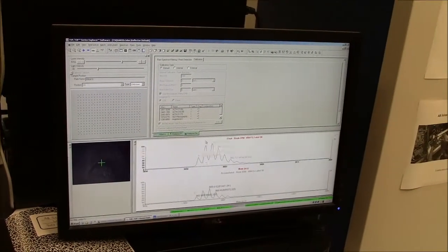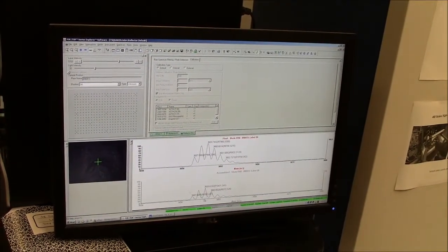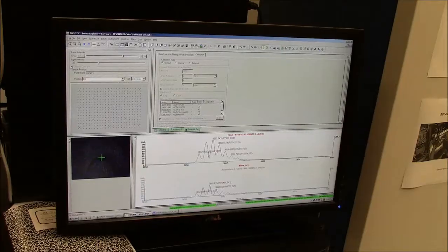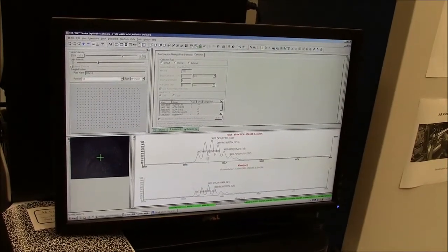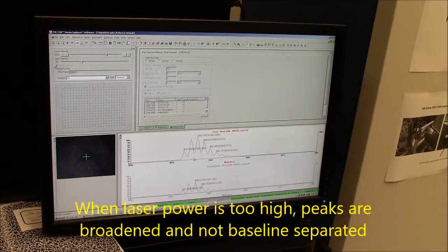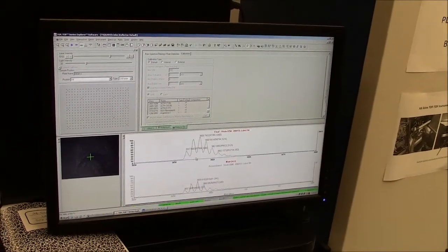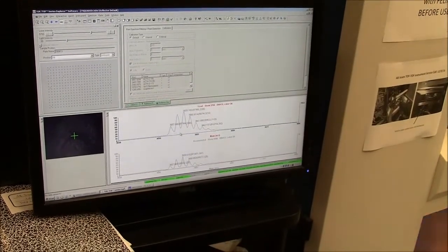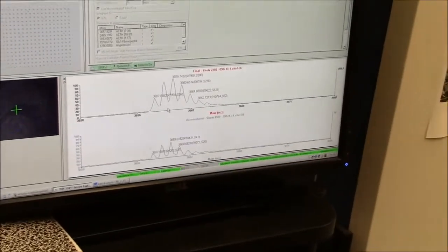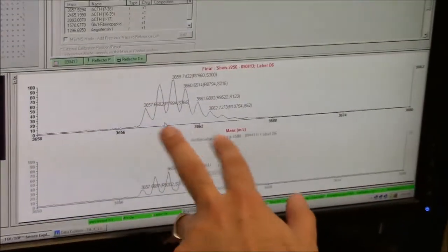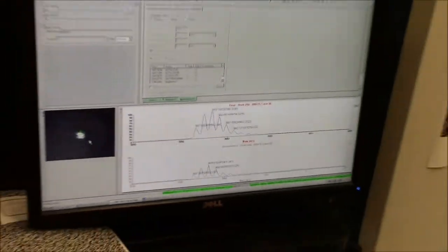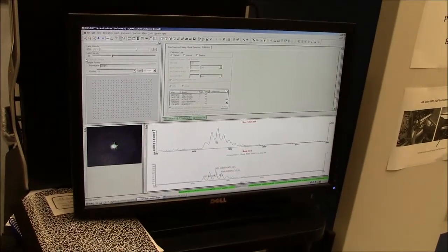Now you can see this a lot better, right? But you can notice that the peak shape is no longer sharp. And the isotope spacing is no longer going to baseline. So that broadness is caused by too much energy and charging on the plate. And your molecule holding on to just a little bit of that energy. So when the same molecule comes off and hits the detector, they're slightly off of each other when they accumulate and add in. And so that's actually giving you an artificial broadness on your peak. And so if you keep going to higher and higher laser powers, you'll realize that you're getting, actually you start getting worse and worse peak structure and worse and worse data.